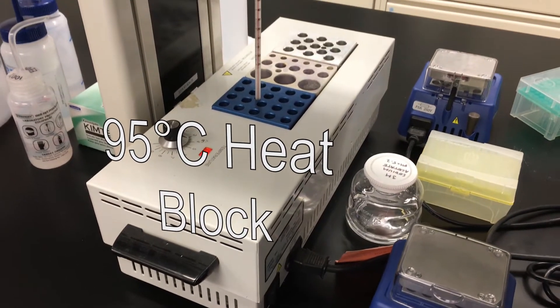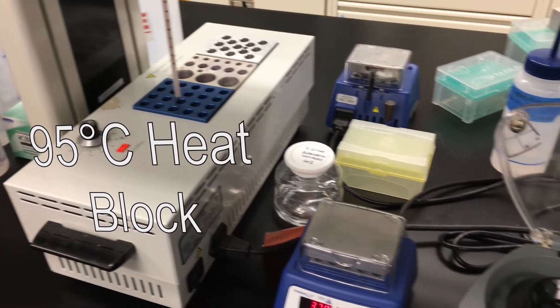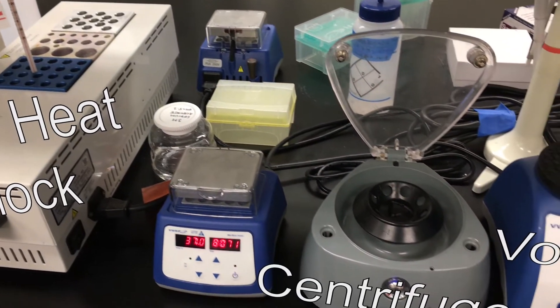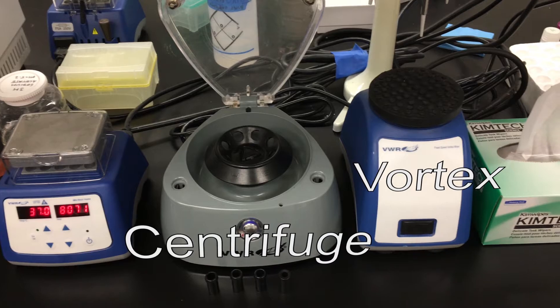The benchtop equipment we will use includes a heat block set to 95 degrees Celsius, a benchtop centrifuge, and a vortexer.